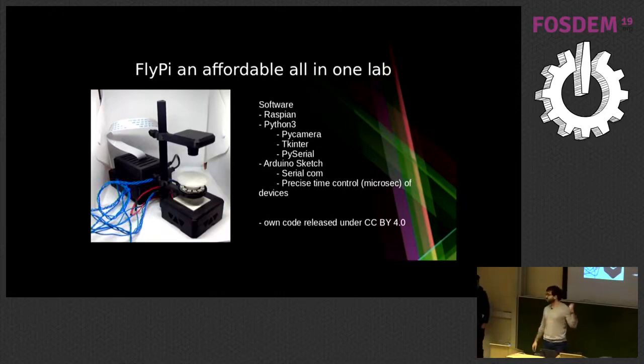The problem is if you want to use this for diagnostics, where you have privacy issues and patient data and things like that. So encryption, basically. And again, because I'm a biologist, this is the best that I know of, and I don't know if anybody has a better suggestion for a transfer protocol. So I would love to hear it. VNC or something like that? Yeah, I don't know. So I'm open to suggestions about this.